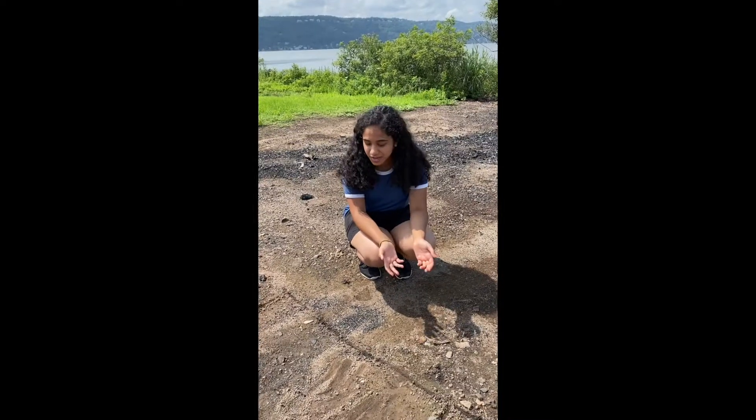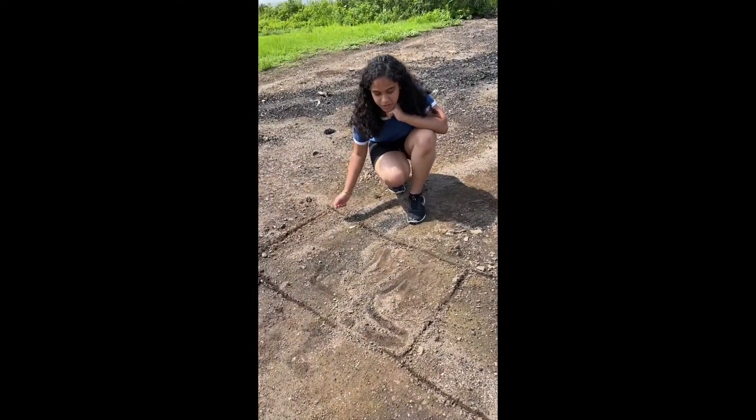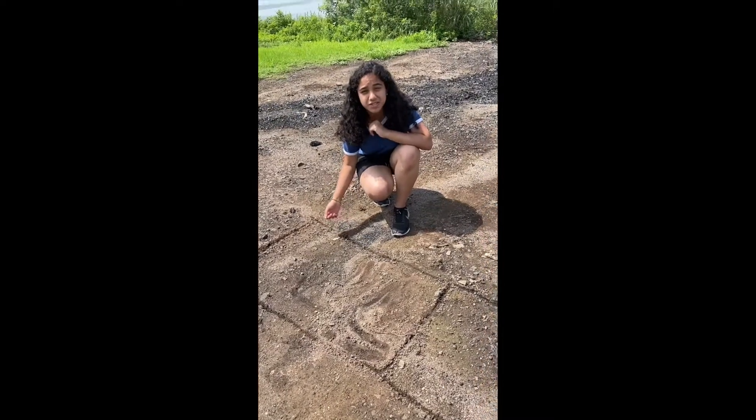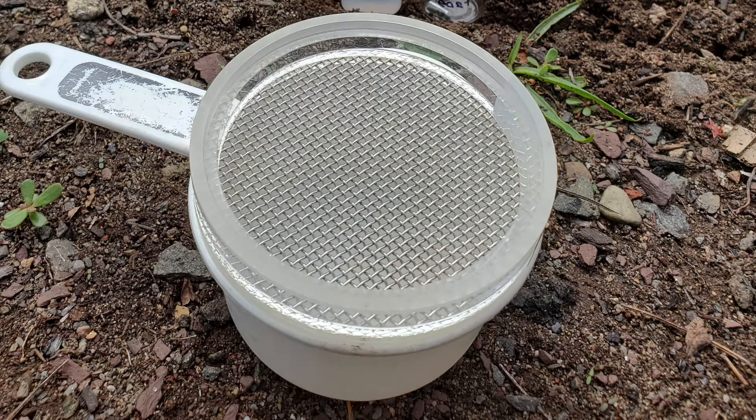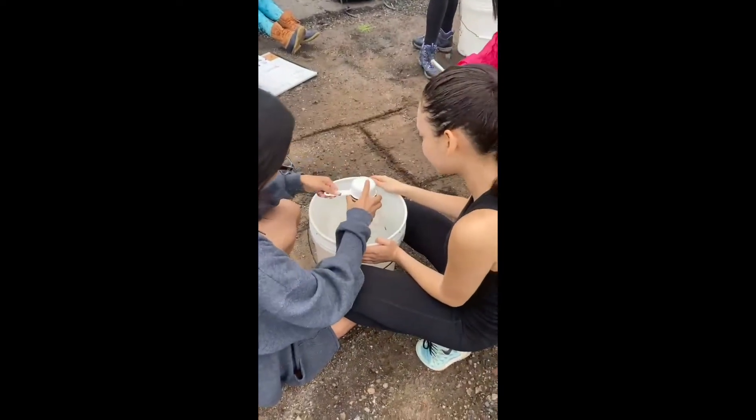Yesterday we created two different transects and took a cup to scrape the surface of the soil, then used a sieve to sift out the soil.